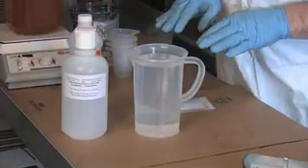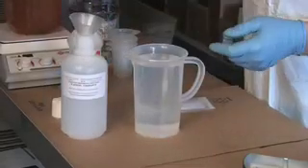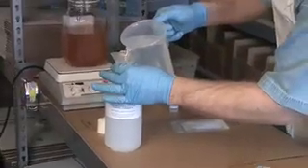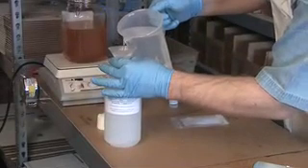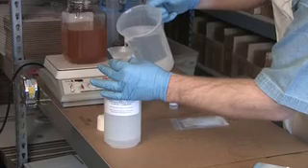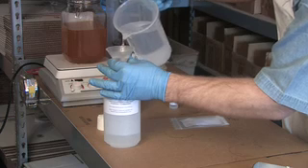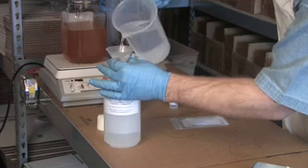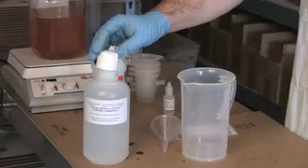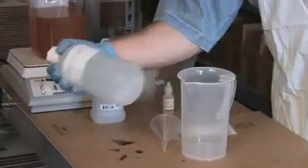We now have fully dissolved catalyst in our liquid, so we're going to pour this right into our jar. We will use this jar for our titration solution going forward. Very slowly, I'm just getting it in there. We've finished pouring. I'm going to seal this up and, just to make sure it's good and mixed, shake it a little bit.